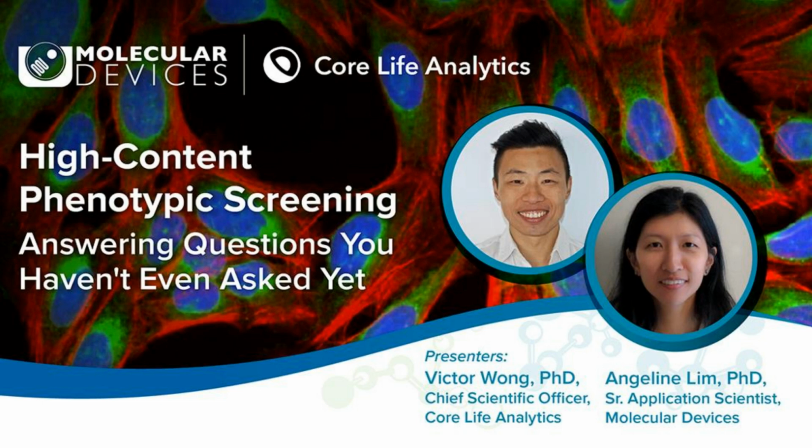I think I can pick up on that one. You can use confocal imaging if you want to, but there are better ways to accelerate the imaging process, because if you use traditional confocal imaging, then you have to take pictures one at a time.